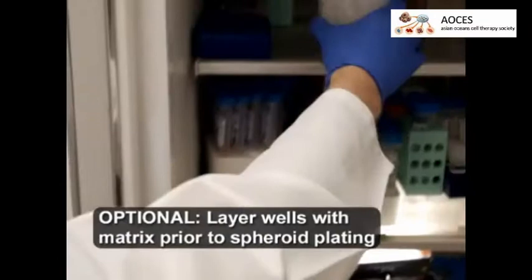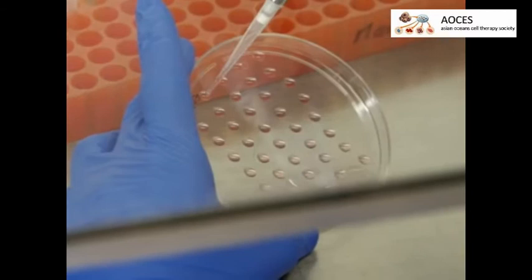To generate the 3D matrix, thaw an aliquot of growth factor reduced basement membrane solution at 4 degrees Celsius overnight.